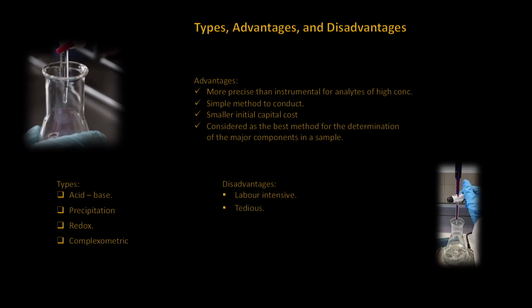They can be tedious at times, and somewhat time-consuming. The biggest disadvantage is that titration is not suitable for samples with low concentrations of analyte, as endpoints become harder to visualize at lower concentrations. The endpoints are not sharp enough to signify the end of the titration. To achieve a good analysis, the individual conducting the titration not only has to be somewhat trained in the procedure, the skills to do so must be honed. But this can be accomplished by doing and practicing.